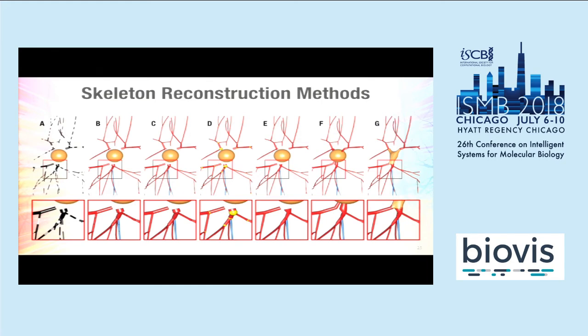And in F, the morphology is one piece, and potentially in G, we have the soma reconstructed on a physically plausible basis. So that's the full morphology after being repaired and the soma reconstructed in a way that would allow us to see the structure of the morphology itself.